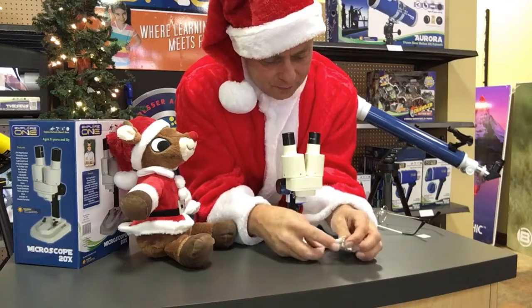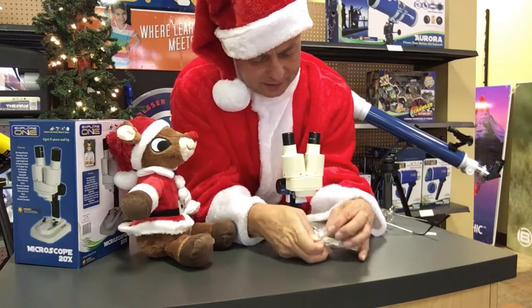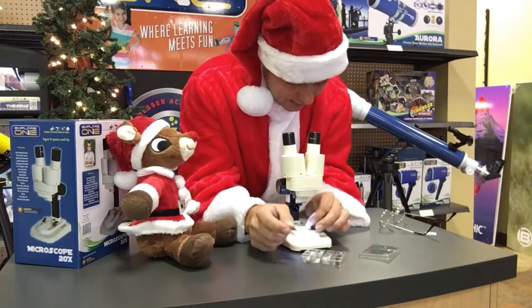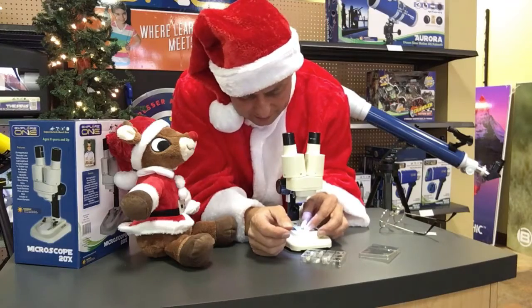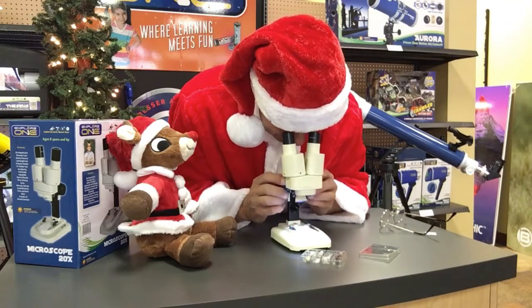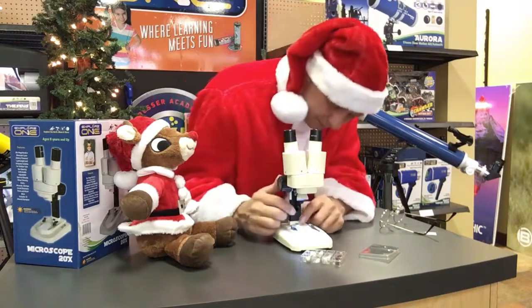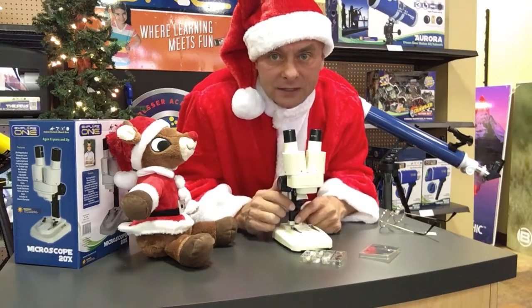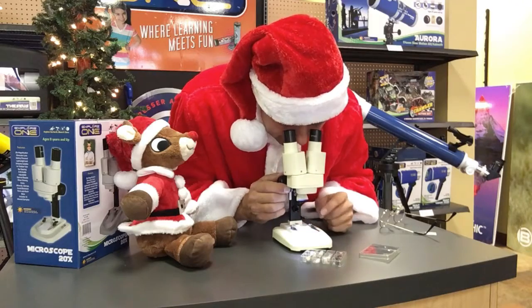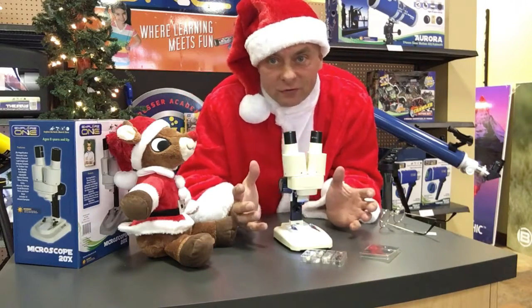You can take some of the sample rocks and minerals that came with it, put one down in there. All you have to do is put it underneath and you can turn these focus knobs and you will see a sharp image. It helps to keep the light turned on because it makes the image brighter, but sometimes you don't want to — depends on what you're looking at, because there's a whole world of things for you to check out.